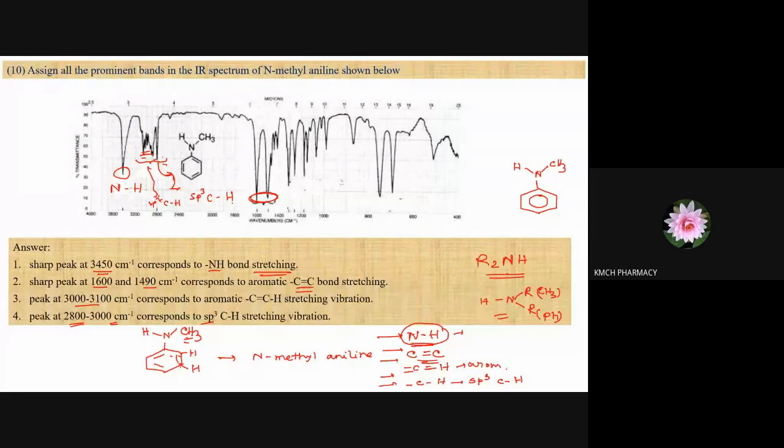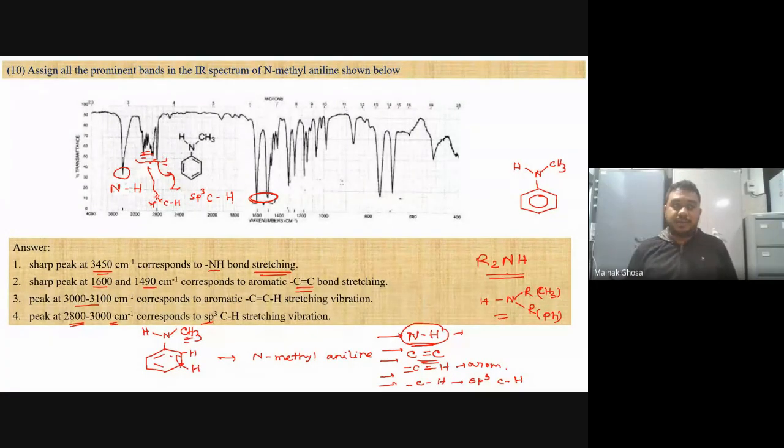But on the other hand, if you go with IR, we pass all the light together from the light source directly into the sample holder. And then later on, we allow the light to pass on to the monochromator. Yes, the opposite thing is happening. That is what you are telling, right?